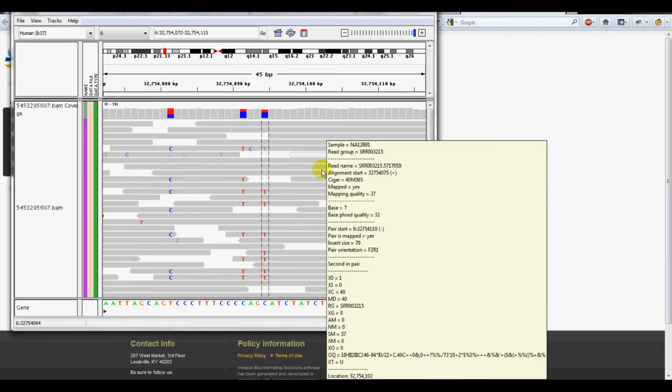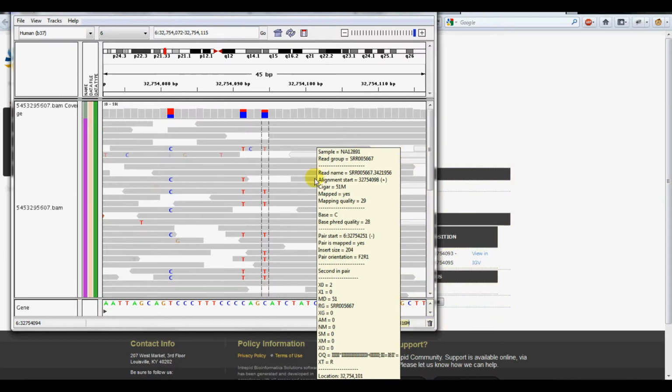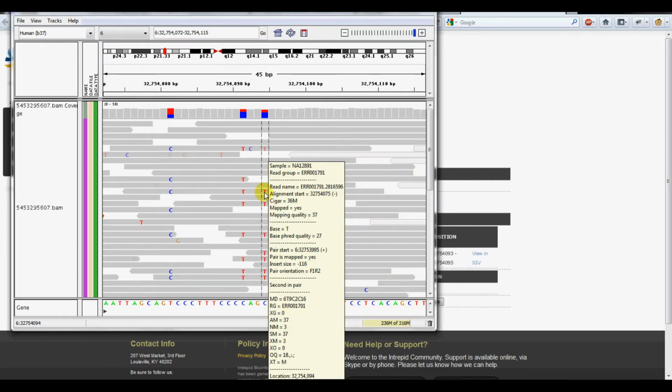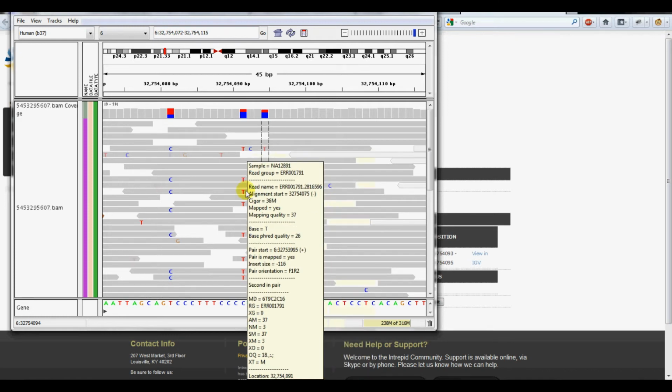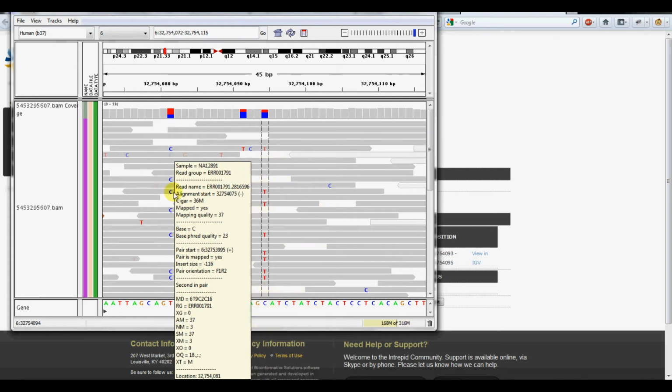But what's more informative with respect to the assay that would have been on the SNP chip is that on the same chromosome as the T allele that was missed by the assay, we can see about 3 base pairs 5' of that, another T allele which differs from the reference sequence, and another 10 bases upstream of that, we see a C allele that differs from the reference.